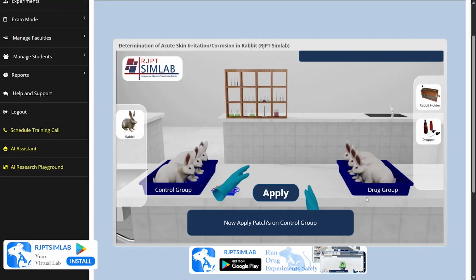Now let us perform our experiment. For that, we will perform our experiment on the RJPT Simlab simulatory laboratory. As we can see here on the left side of the toolbar, we have our animal, the rabbit, and on the right side, we have our rabbit holder, in which we will hold our rabbit, and the dropper, through which we will insert our test substance. On the bottom part, we can see the instruction part, which will show us how to perform the experiment. And above that, we have the apply button through which we will perform the experiment.